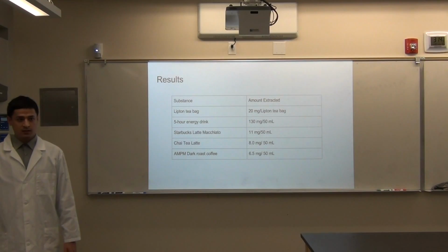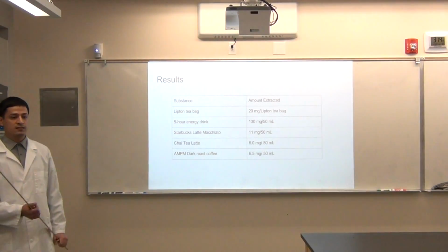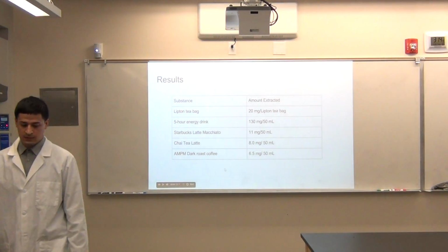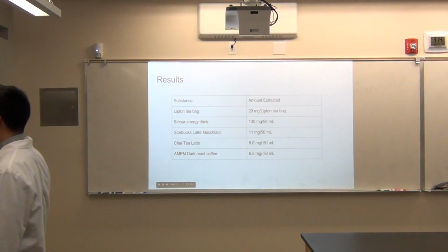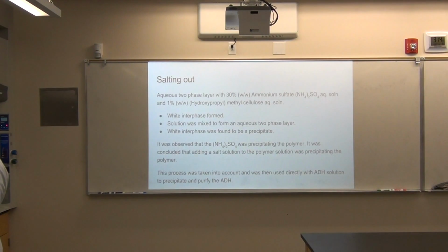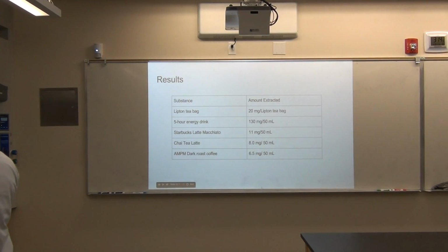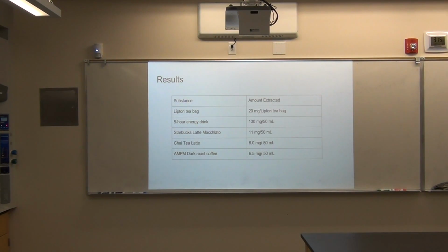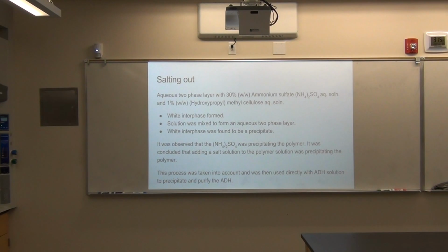And that's a method that's just been used a lot. Yes, ma'am, I use that method as a baseline. Yeah, we tried to incorporate the successful method from last year, which we used to purify the ADH. We said, hey, maybe this is viable for separating other compounds, and that will eliminate the need for toxic organic solvents that we had to use, and we were going to actually put in that. Right. But it didn't work.